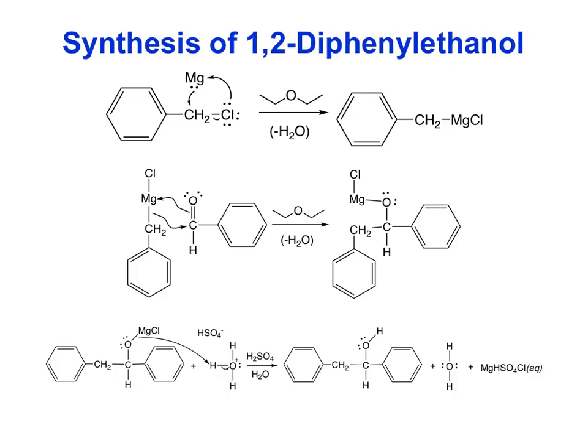Here's another look at the mechanism written out in a standard ChemDraw format. This might help you put together your mechanism in your pre-lab.